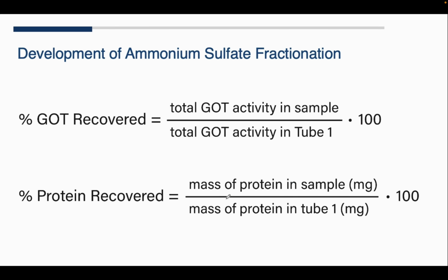So a couple of things that we did, and there's a lot of data so we didn't show it to you, but to show you what we were doing is that we figured out the percent of GOT recovered. Right? And so then we showed the total GOT in the sample compared to tube 1.